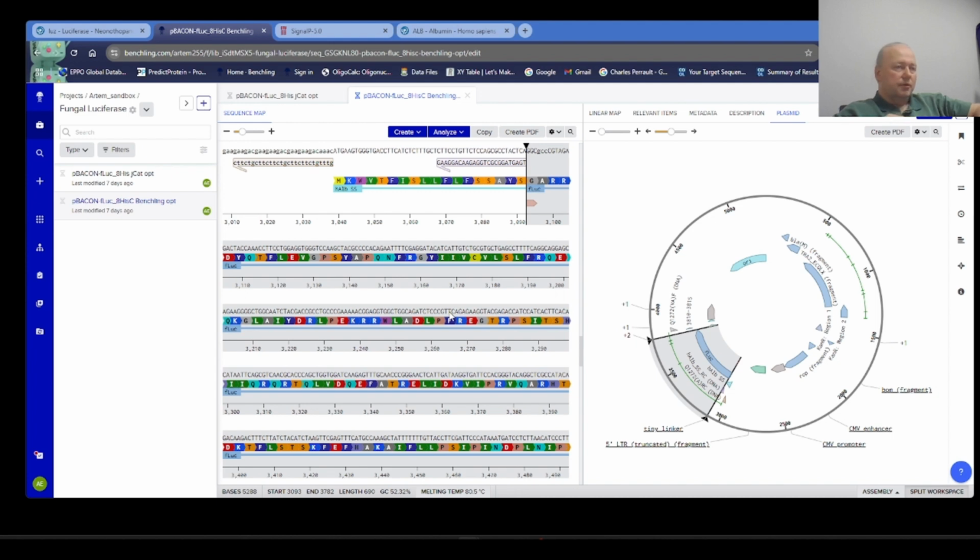Obviously all the other parameters like the location of the tag and so on may also impact secretion and expression of these proteins. So in reality this is a little bit of a silly experiment, but ultimately we just want a protein with a tag expressed in mammalian cells. So that's not a big deal. Alright, so now we have these 2.